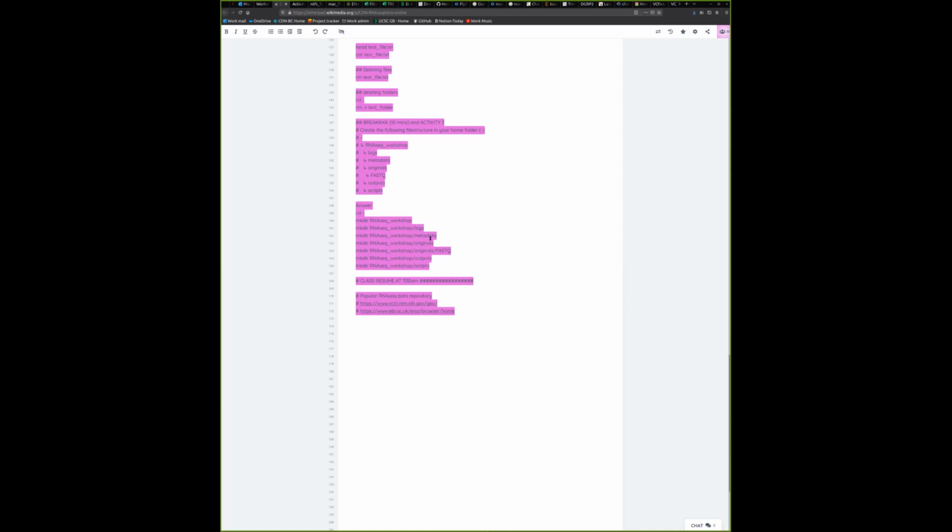Originals stores all the original files that you downloaded or retrieved, either from your sequencing facility, or if you downloaded data from somewhere else, it's nice to put it into originals. Then have another folder called output that processes these files to create output files. So separate the originals from the outputs to manage your directory a little bit.